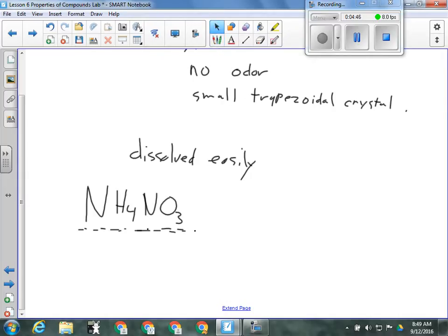I think that's all the stuff I needed to tell you. The rest of the stuff will work exactly as we had planned. Remember that the tests you are doing, you will start with the observable properties test. Record everything that you can see about that material. Do the wafting test of the main samples up front, just one person, someone who isn't congested and can smell, and then do the solubility test, then do the conductivity test, then do the pH test.